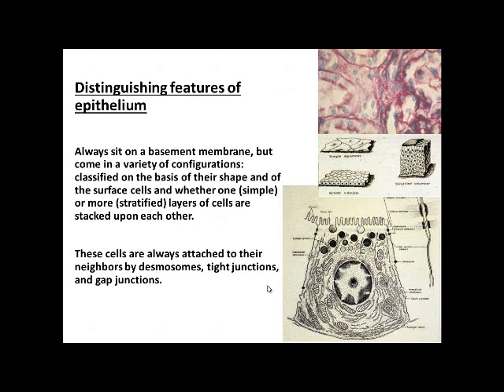Now, a distinguishing feature of epithelium, because we're going to talk about epithelium in the presentation, is the epithelium sits on the basement membrane, and right in through here we can see the basement membrane of the cell. This is the glycocalyx associated with the sugars that are located in the lumen, but there's also sugars here, carbohydrates that are associated with the basement membrane.